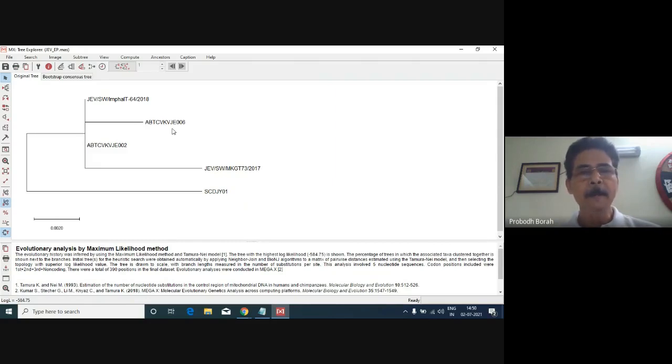So I think you could follow each and every step, and you can repeat it in your laptop now. So this is all I wanted to show you today: the alternative approach in doing phylogenetic analysis by directly downloading the sequence information from the GenBank and then directly uploading to the Mega 10 software. So this is a simpler method and faster method.